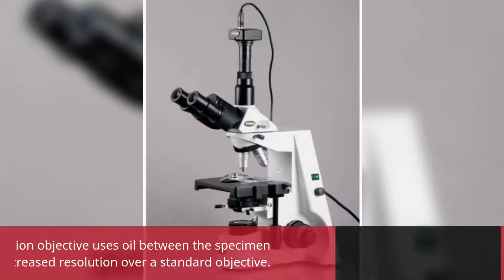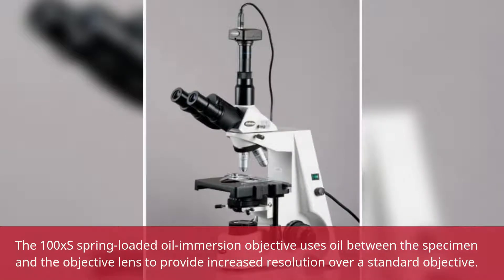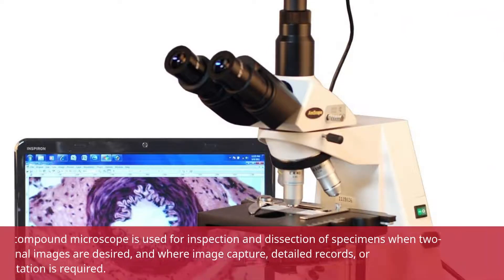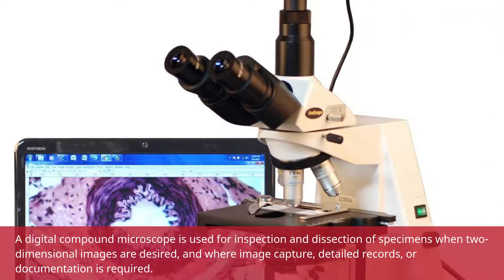The 100x spring-loaded oil immersion objective uses oil between the specimen and the objective lens to provide increased resolution over a standard objective. A digital compound microscope is used for inspection and dissection of specimens when two-dimensional images are desired, and where image capture, detailed records, or documentation is required.